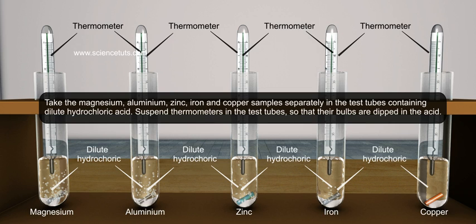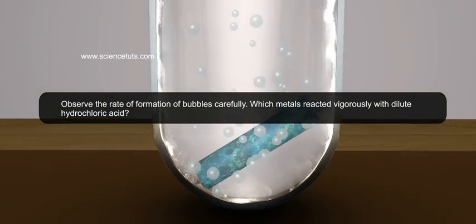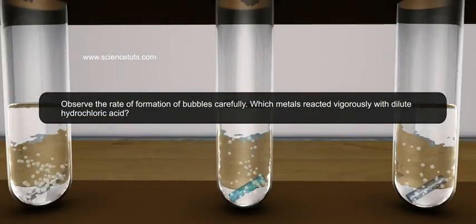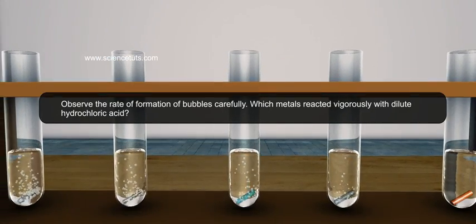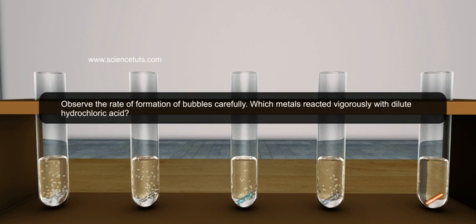Suspend thermometers in the test tubes so that their bulbs are dipped in the acid. Observe the rate of formation of bubbles carefully. Which metals reacted vigorously with dilute hydrochloric acid?